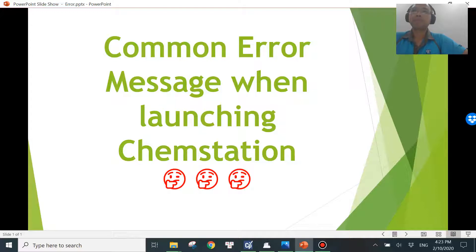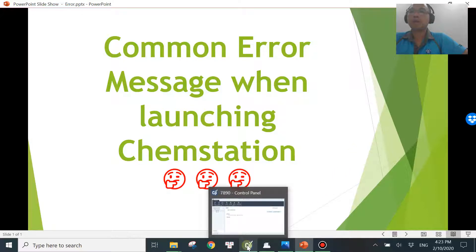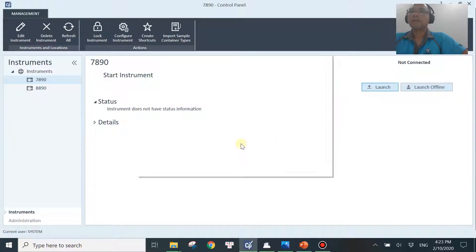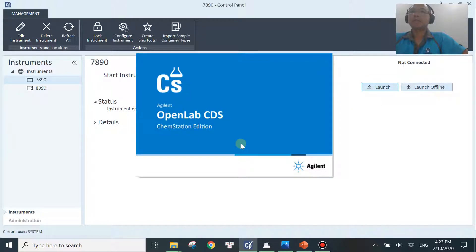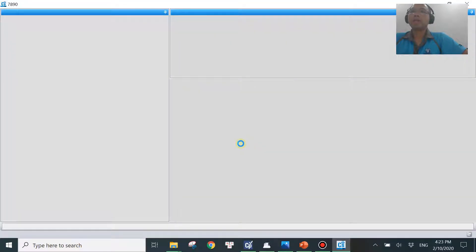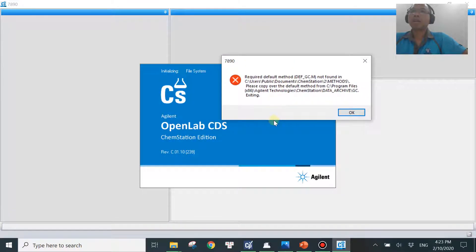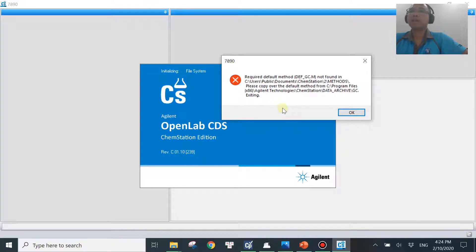Let's get into this error message. Starting with the OpenLAB control panel, if I launch the software, sometimes you will see this message come up. It will depend slightly on which version you are using and the message may be a little bit different. The version I'm using is C01.10, which is the latest version. The message is quite clear and actually tells you what to do.